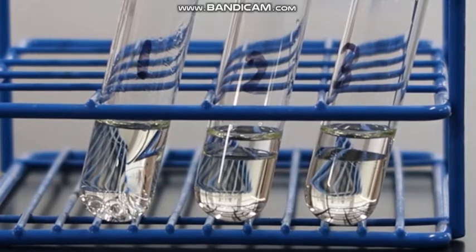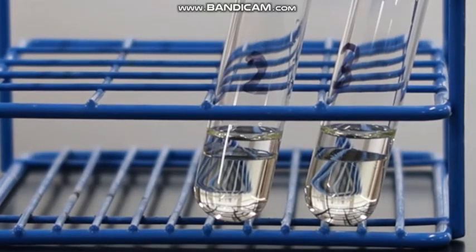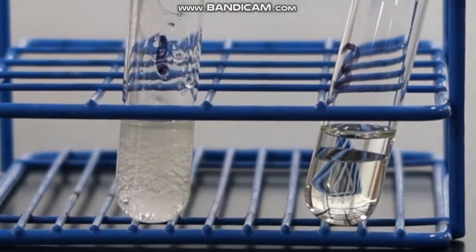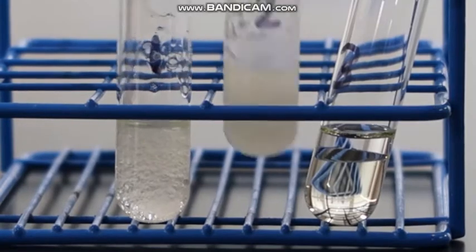Our initial observation is that there isn't much difference between the three test tubes. I'll agitate each one of them so that we can see a little more about the interactions between the liquids in each.